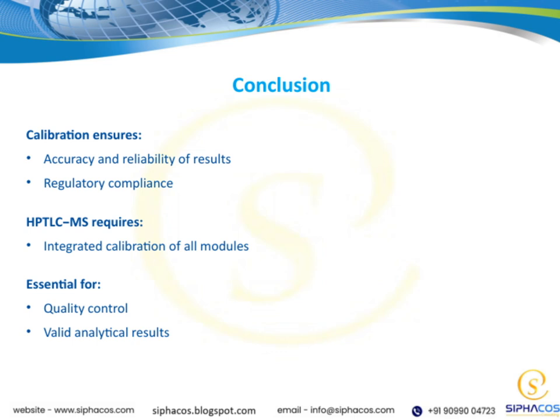This overall process is not just about technical accuracy, it's fundamental for quality control. It helps us deliver trustworthy results that meet regulatory standards and support sound decision-making. So, in summary, proper calibration is the backbone of reliable, compliant, and high-quality analytical work.